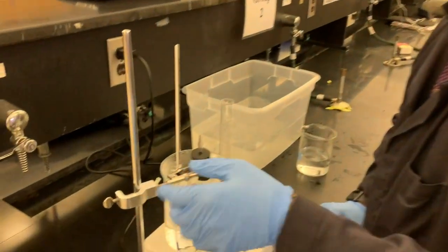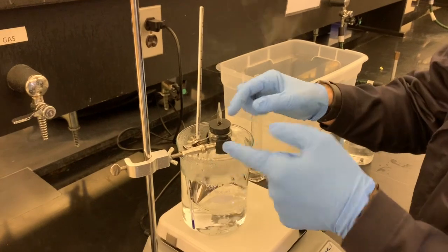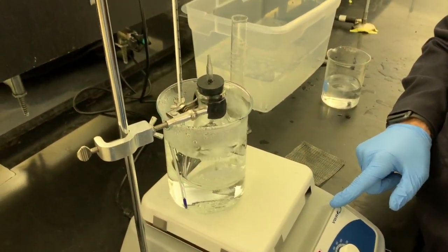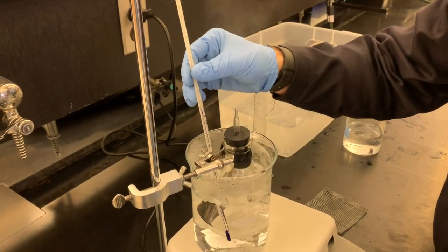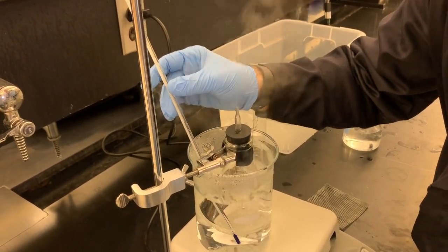The biggest thing for this is making sure that, again, you check your temperatures regularly. I got my flask dried off with my Bunsen burner over there, and I put it back. It's a little smelly in here because the plastic didn't like it very much. And I have it boiling in this water bath. Very important for the water bath, it needs to be as hot as possible. You want that big temperature change to help you get a really clear result. So I have the thermometer, and it says I'm at basically 101.5 degrees.